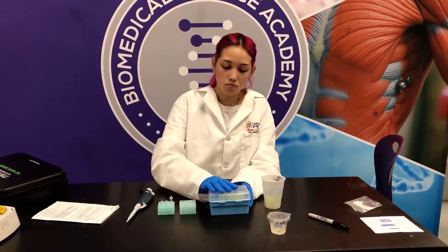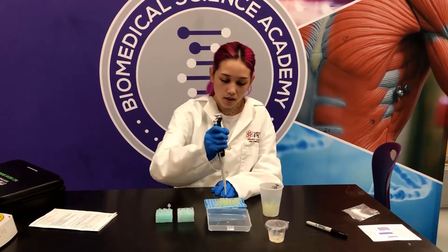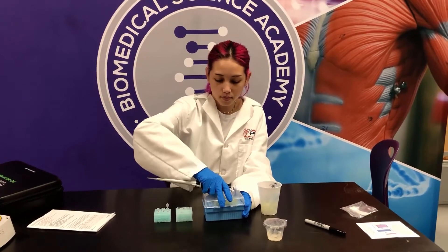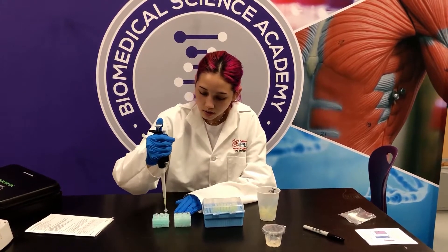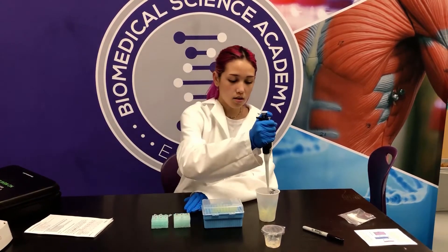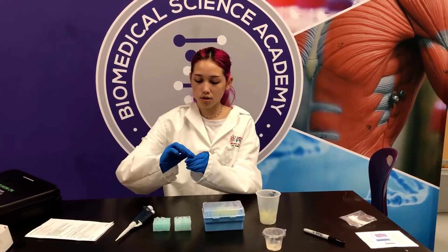Then I'm going to open this again, get a new tip, and close it. Dilution buffer into tube four. Get rid of the tip and I'm going to close the last two tubes that we have open.